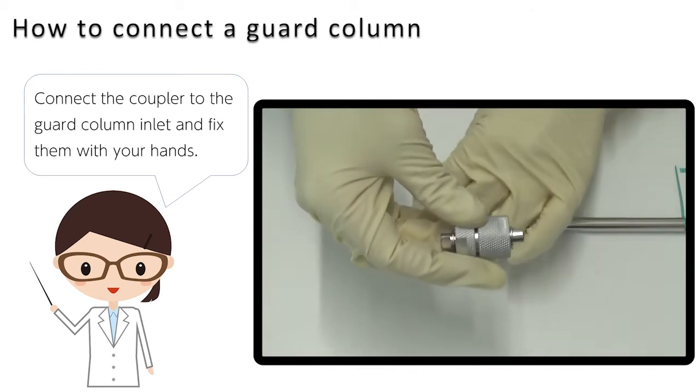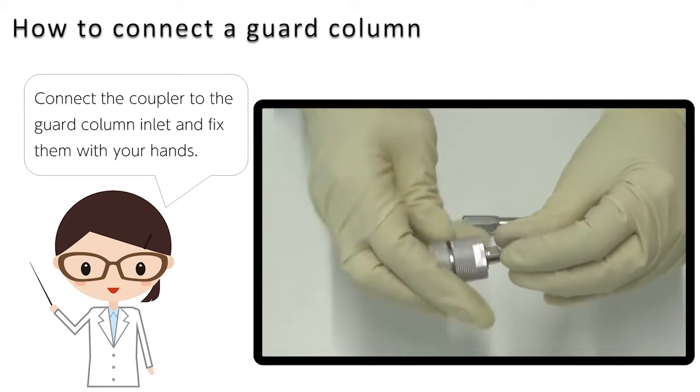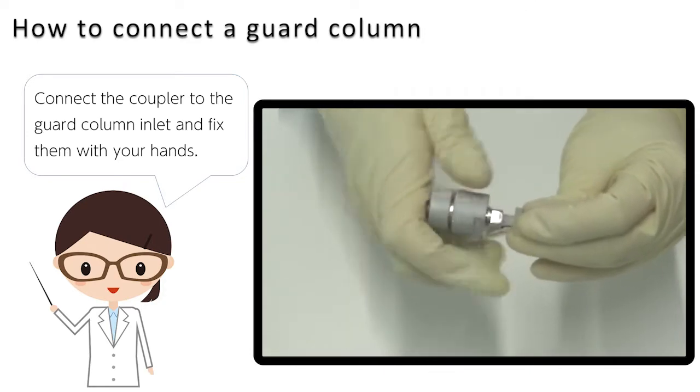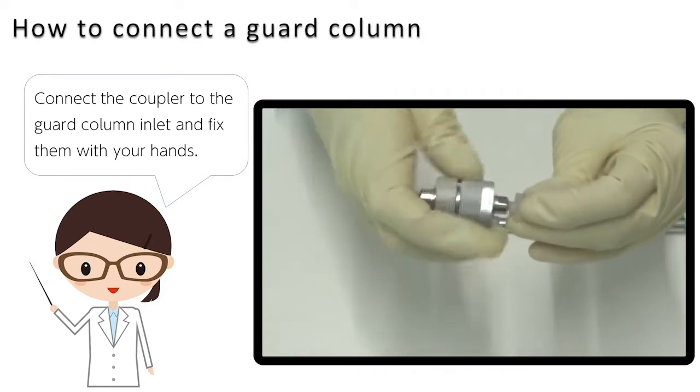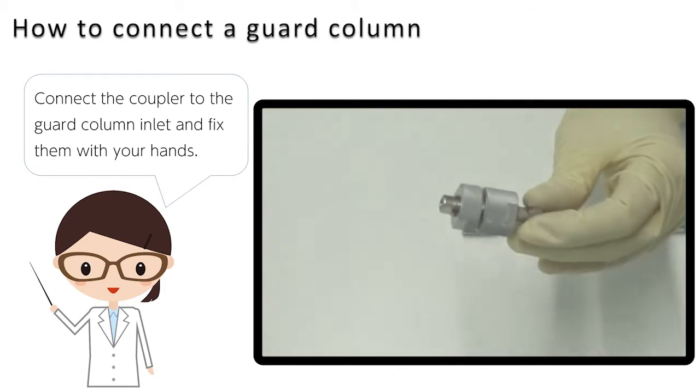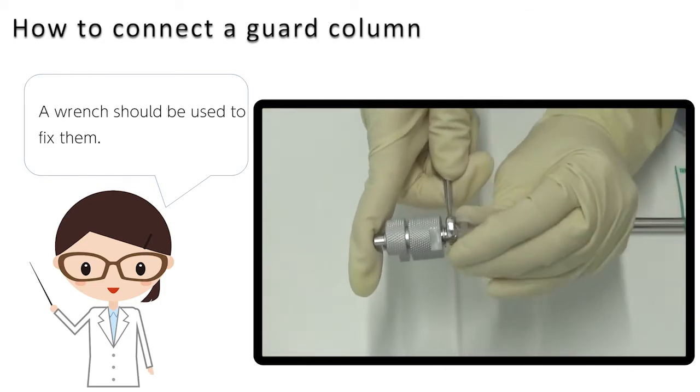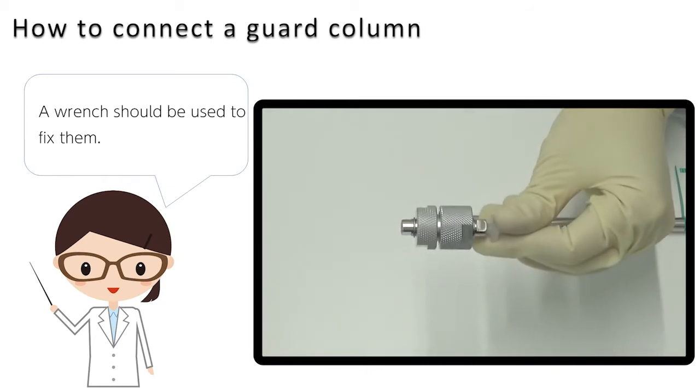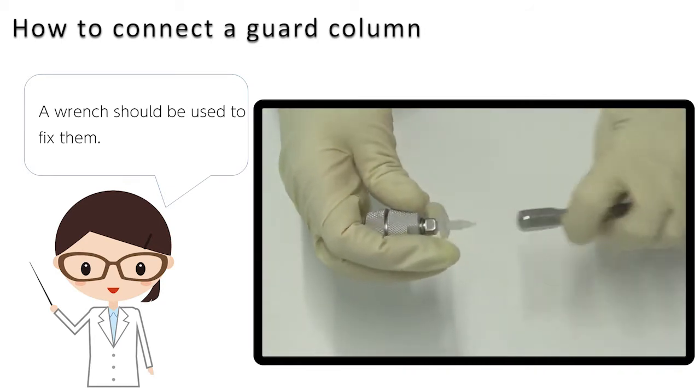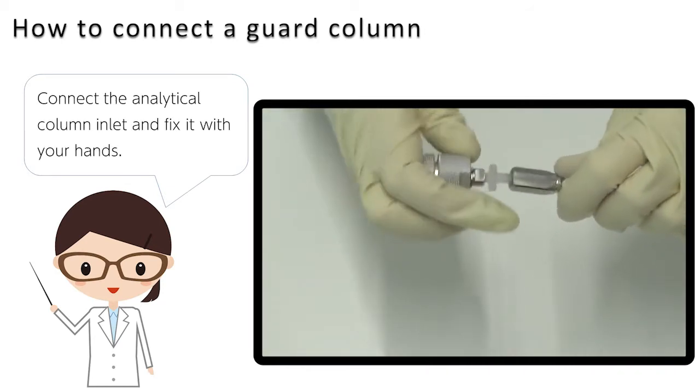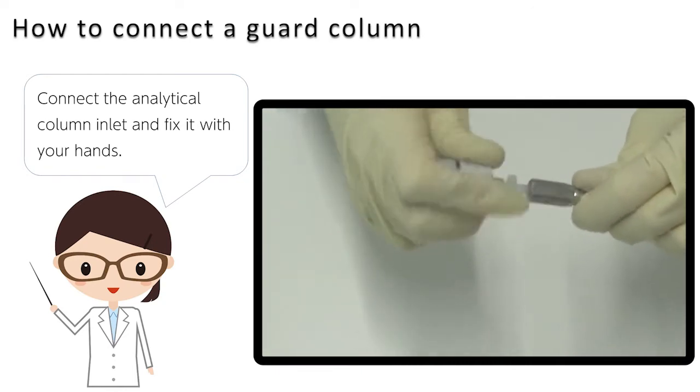Connect the coupler to the guard column inlet and fix them with your hands. A wrench should be used to fix them. Connect the analytical column inlet and fix it with your hands.